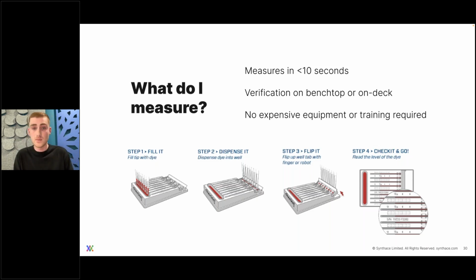These are intended to be used with their red dye as a proxy to measure the accuracy of your liquid handler or pipette, but they are compatible with various samples, I think like DMSO, glycerol, ethanol, albeit at low concentrations. Admittedly, the accuracy is not as impressive as the Artel, but considering their convenience, these are a really great way to get started with liquid class optimization. And the ability to use them on deck as well is super neat.